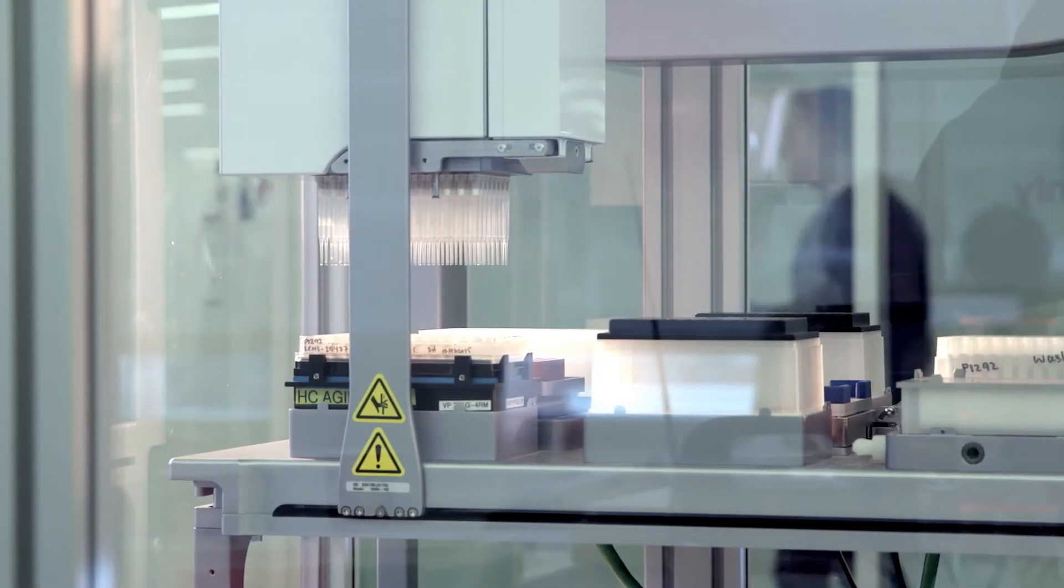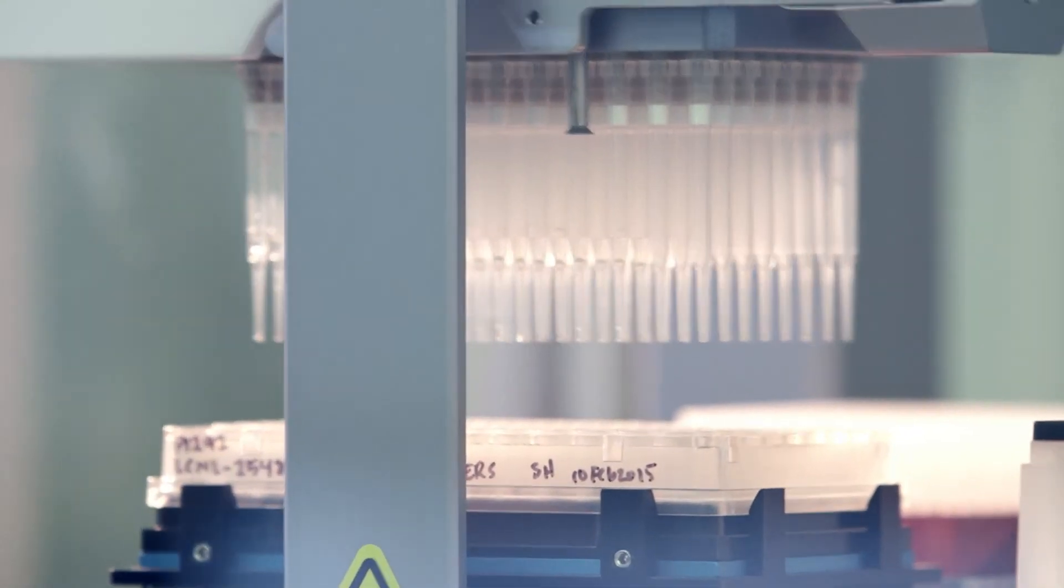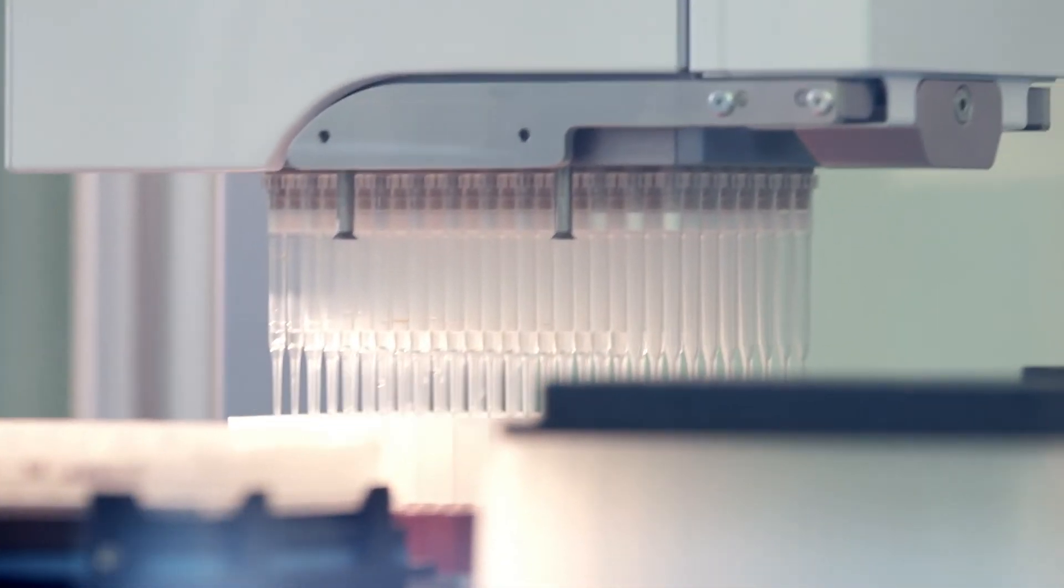As they represent the entire coding region, our sets are able to capture the desired genes from multiple angles, ensuring that all classes of alterations are captured.